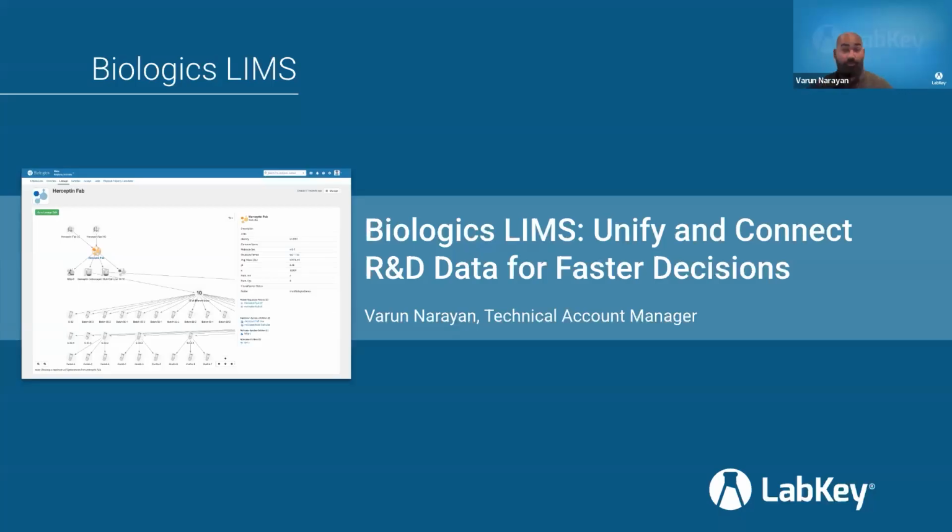My name is Varun Narayan. I am a technical account manager here at LabKey. And today we're going to be talking about our Biologics LIMS product and how it's going to help you unify and connect your R&D data for faster decisions.